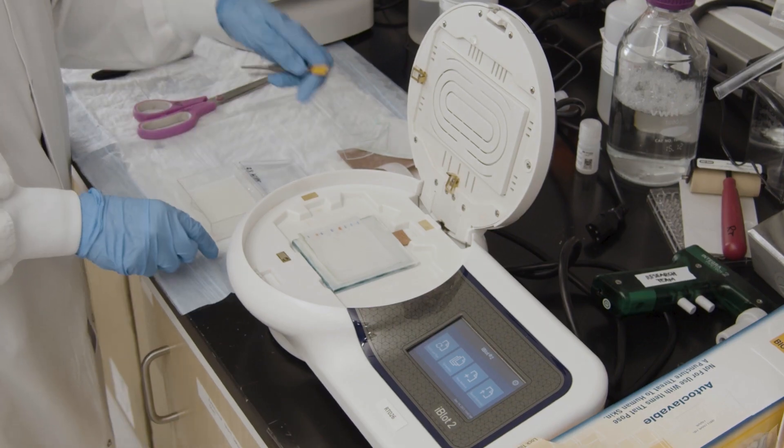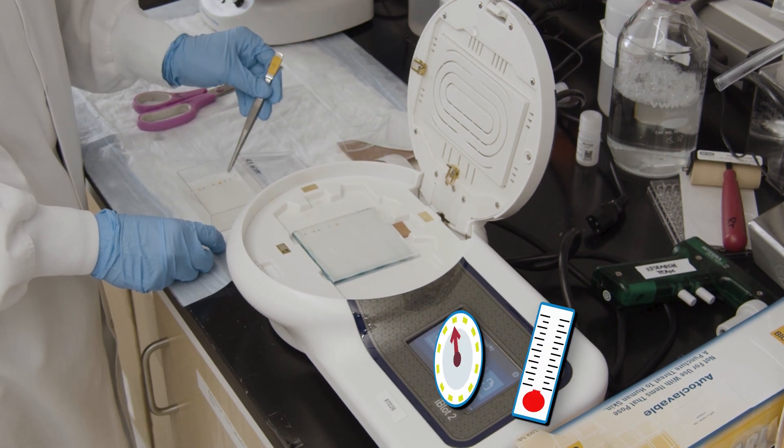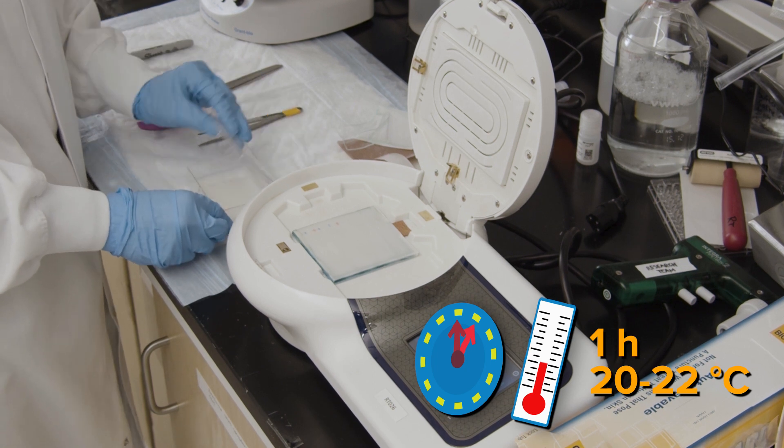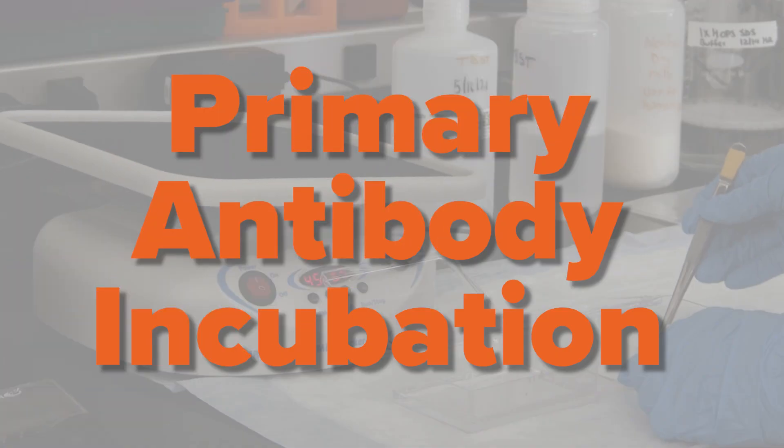Using forceps, carefully transfer the membrane to a container of blocking buffer and block for one hour at room temperature. The blocking buffer used, typically milk or BSA, is antibody dependent. So take care to refer to the antibody data sheet before preparing. Alright, you have about an hour until your gel is finished blocking. While you wait, you can prepare your primary antibody.